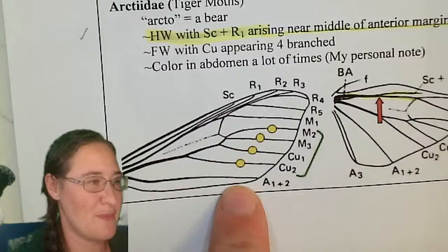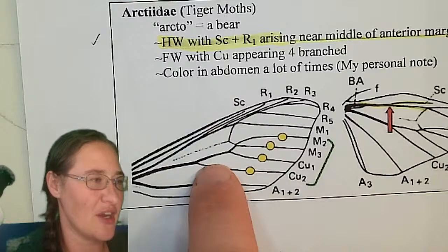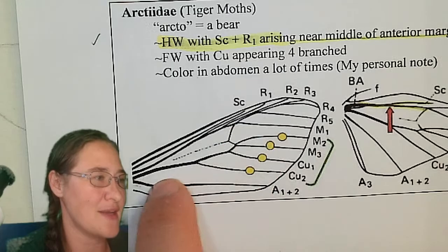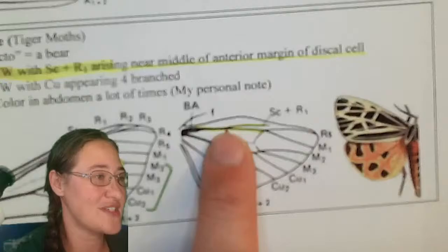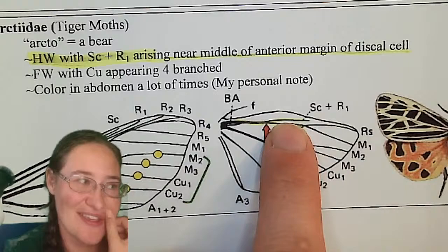When we look at the wing venation, we'll see that off of this cell here, there's going to be four branches that come off the bottom half of this cell. That's one characteristic. The other characteristic, and I even used this specimen as an example, is right here on the subcostal cell.